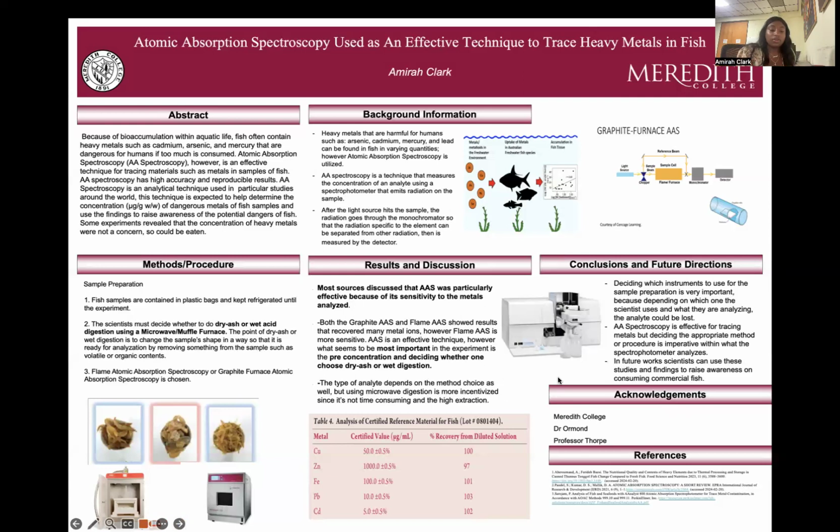because most of these articles are testing samples on commercial fish, like tuna, just any fish that people are most likely buying from the store and using. However, one of the studies I researched used fish from a local lake, for example. So, in conclusion, that is my presentation.